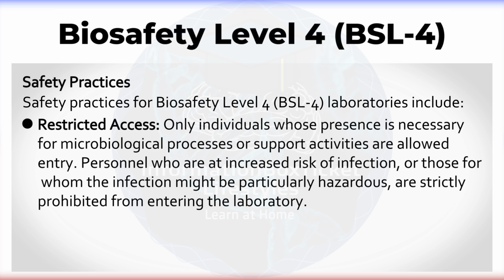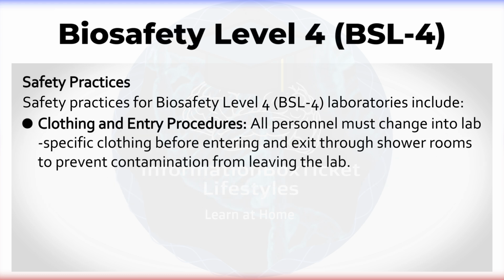Restricted access. Only individuals whose presence is necessary for microbiological processes or support activities are allowed entry. Personnel who are at increased risk of infection, or those for whom the infection might be particularly hazardous, are strictly prohibited from entering the laboratory. Clothing and entry procedures. All personnel must change into lab-specific clothing before entering and exit through shower rooms to prevent contamination from leaving the lab.